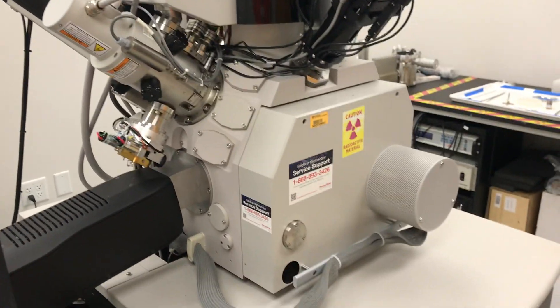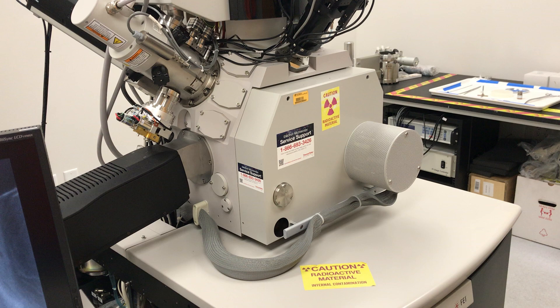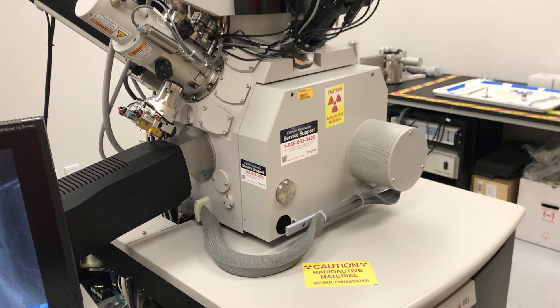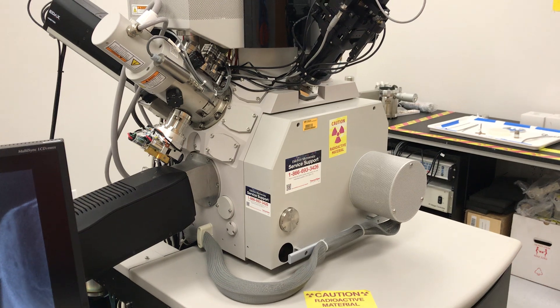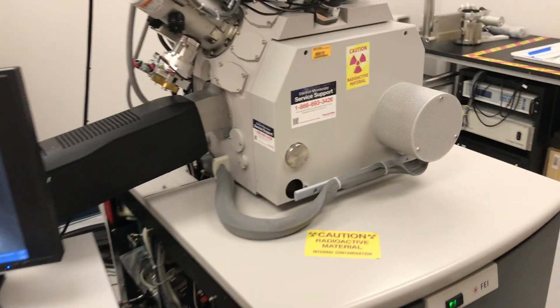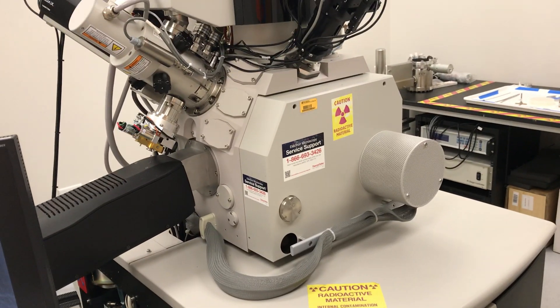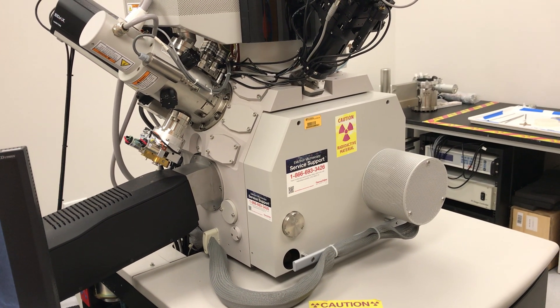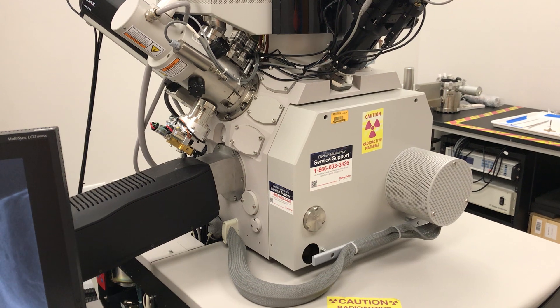The other thing you have to understand is that when you're operating the microscope and water is circulating around the lenses, that can potentially impart some vibration to the system. Obviously that's not good, because vibration will result in an image that's shaky and has instability. But if the flow through the microscope is insufficient, then the chiller will not work properly either. In order for the set point to be hit on the chiller, you have to have sufficiently high flow.